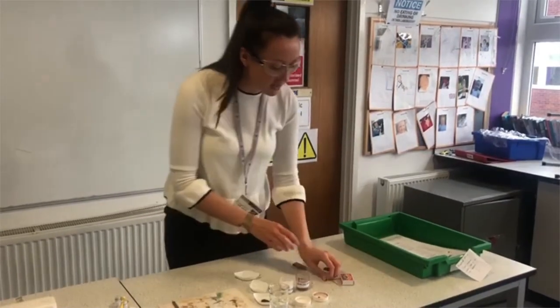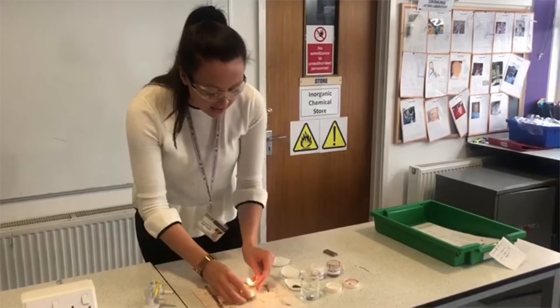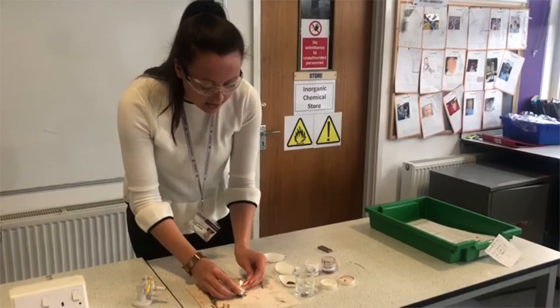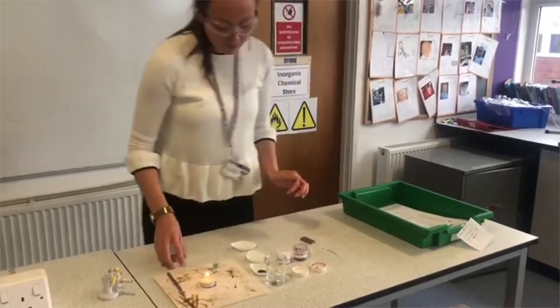So what we're going to do is try and turn iron oxide into iron so that Iron Man can have that for his suit. I'm going to take a match and put it on top of my safety mat.